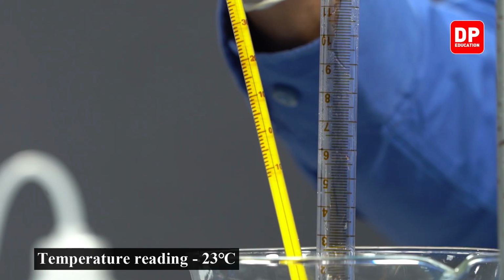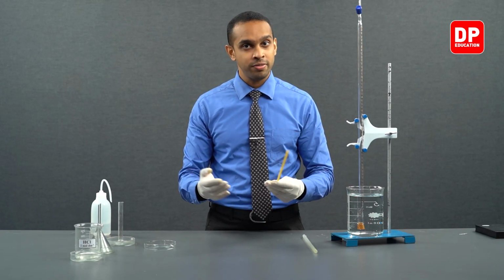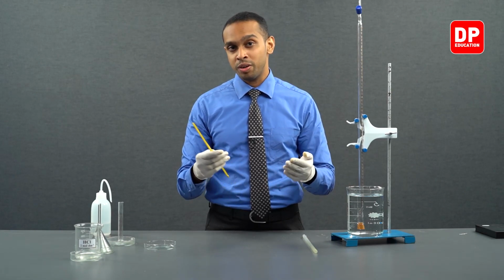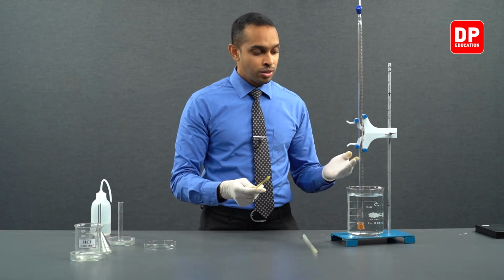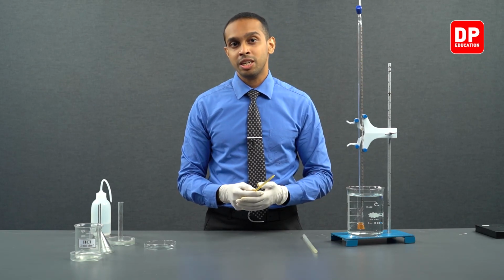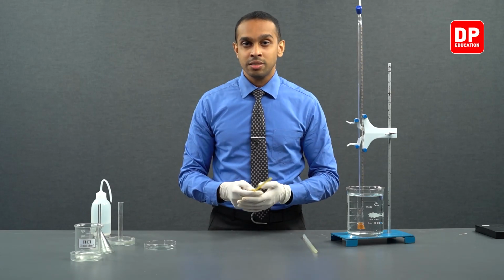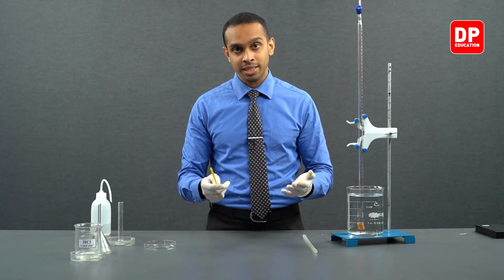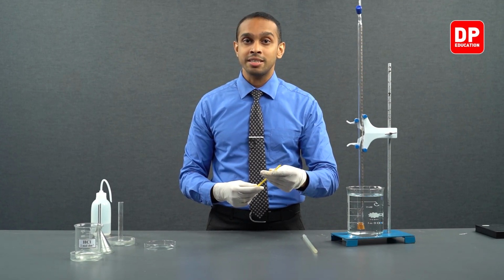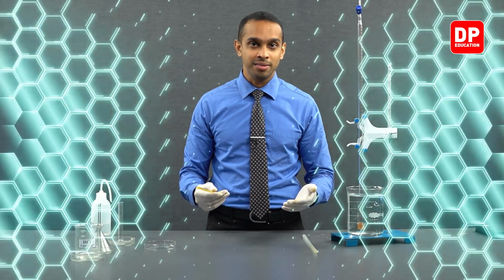Now, after noting down these measurements, the mass of the magnesium strip was 0.05 grams, and then we collected hydrogen gas that is produced when we reacted the magnesium strip with HCl. So the volume of the hydrogen gas was 49.8 cubic centimeters or 49.8 milliliters. The pressure of the gas was considered to be the atmospheric pressure, which is 1 atm, and now we have the temperature, which is 23 degrees Celsius. With this information, let's move on to our final trial.